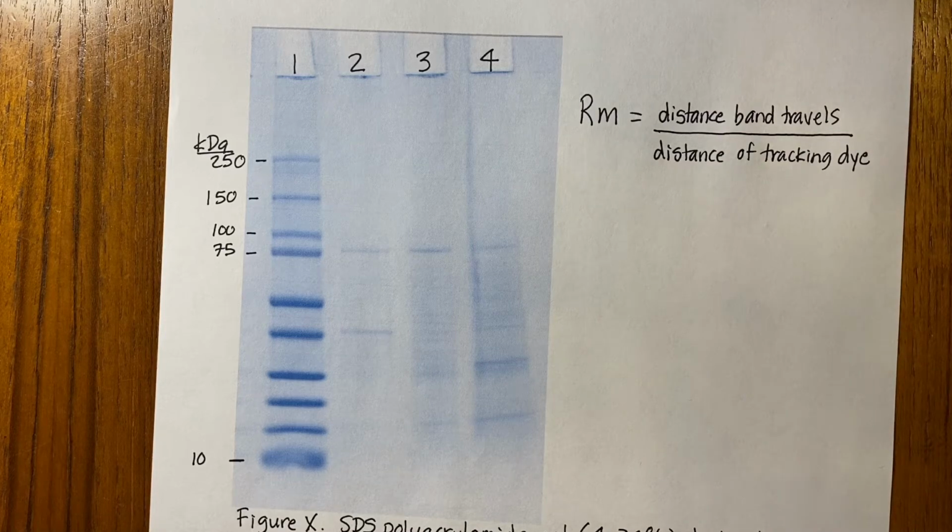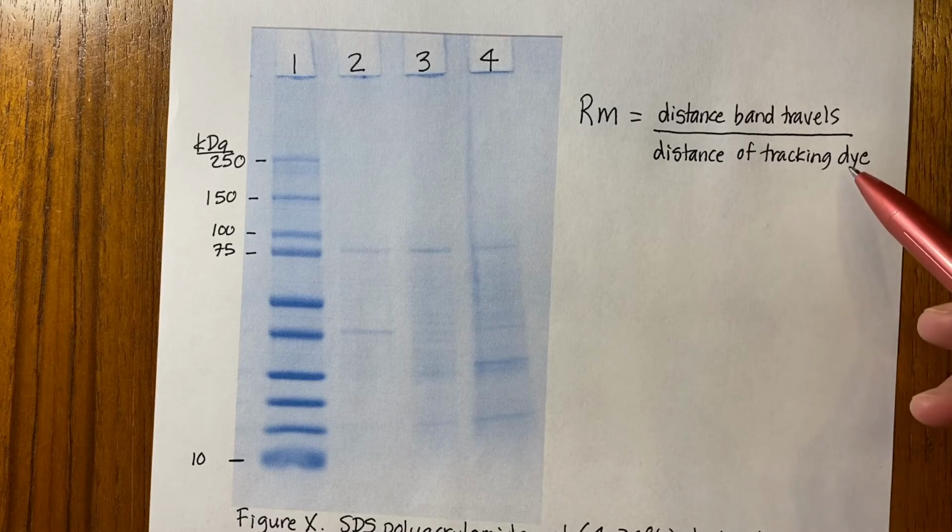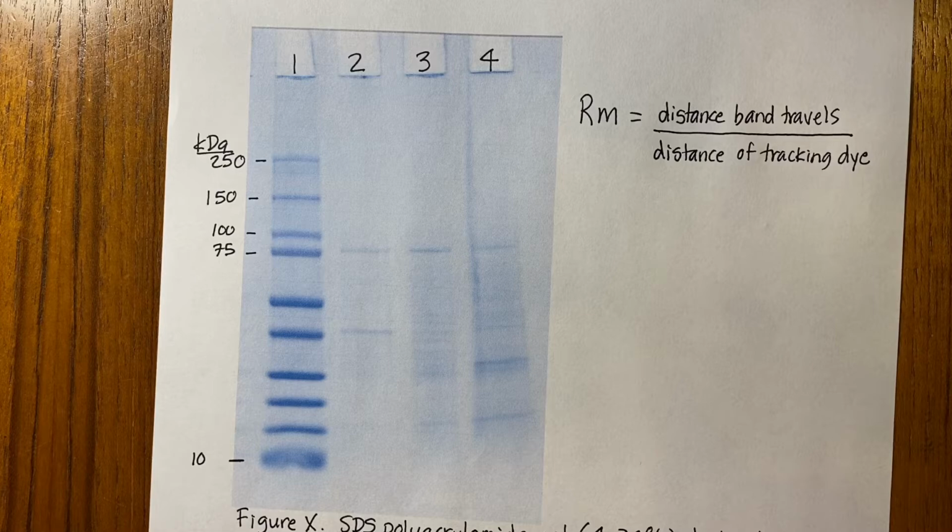The tracking dye is the blue dye that's in the sample buffer. If you had made the samples and run the gel, you would have added a blue dye, and that's a tracking dye. So that's how we determine the length of the gel, essentially. So we don't actually have the tracking dye on this picture. It would be down here, but this picture was taken after the gel was destained and the tracking dye disappears.